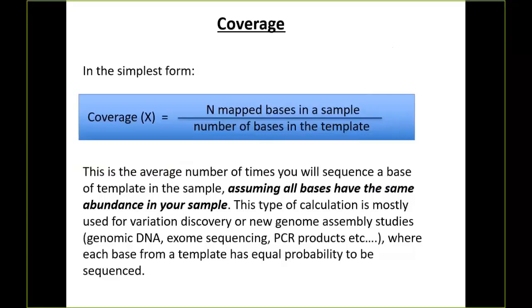If somebody's talking about coverage over an entire genome, typically that comes up with genomic variant detection. They're talking about how many times, on average, each base in your targeted region was read. So for example, when I say an exome with coverage of 80x, that means on average, the targeted bases, so exome is just targeting the exons of the genome. On average, the exons that I tried to read, each base was read 80-fold. However, there's probably no coverage or minuscule coverage outside the exons.